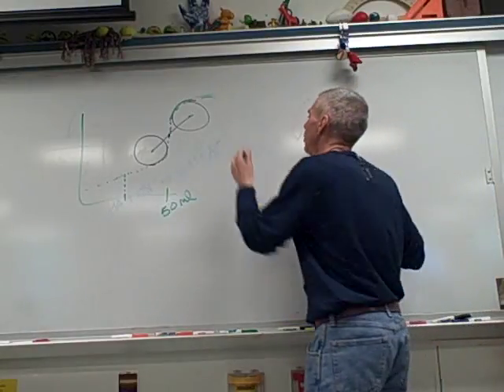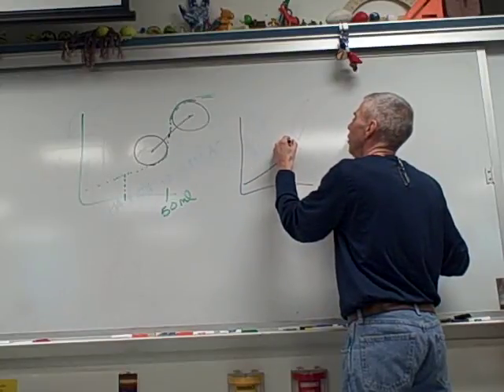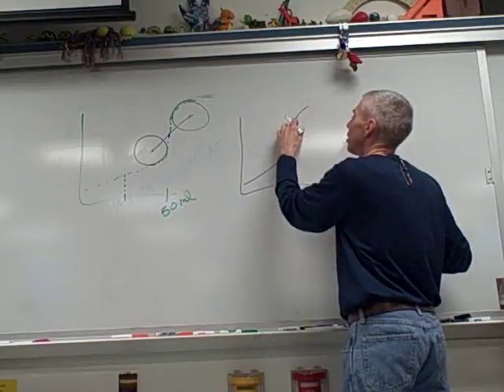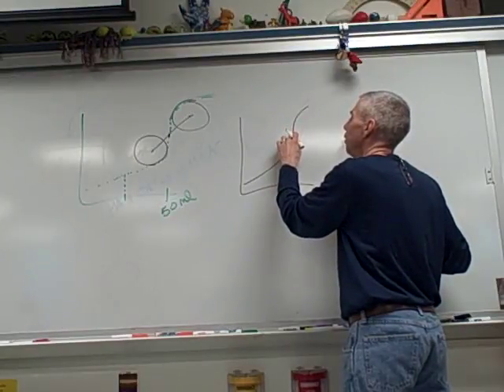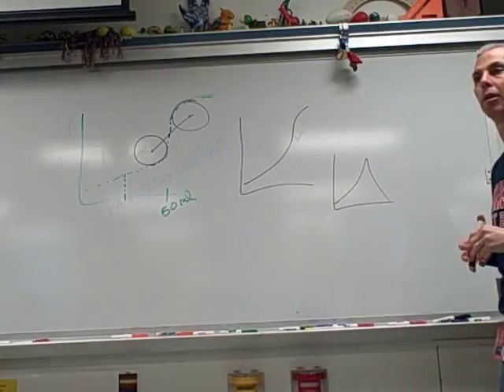Now, what I said to you guys is, if you think about it, this is changing slopes, is it not? This is going from one slope to another slope. We can find the point of inflection. In fact, you can graph the point of inflection, and it'll give you a neat little peak right there where it's supposed to be.